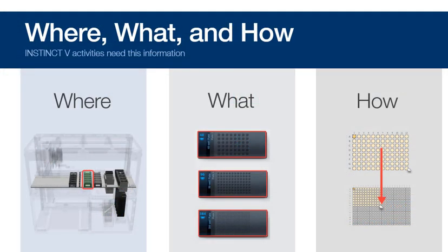And this only requires knowing how to set the where, what, and how, which we will cover in this video for InstinctV. If you want to learn about the features and basic navigation, please watch the introduction video.